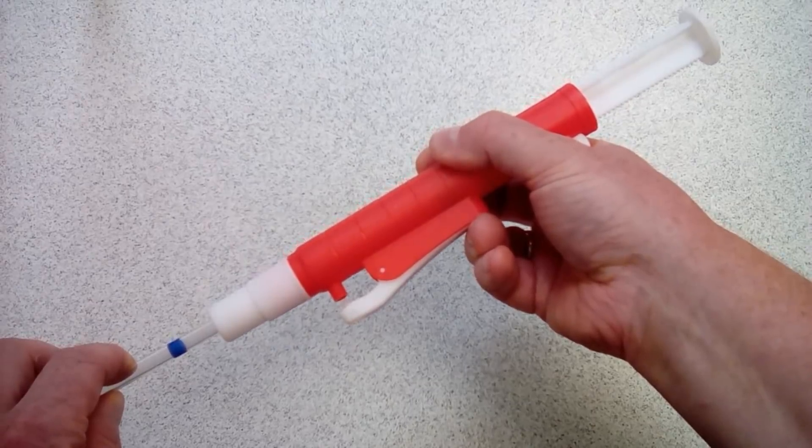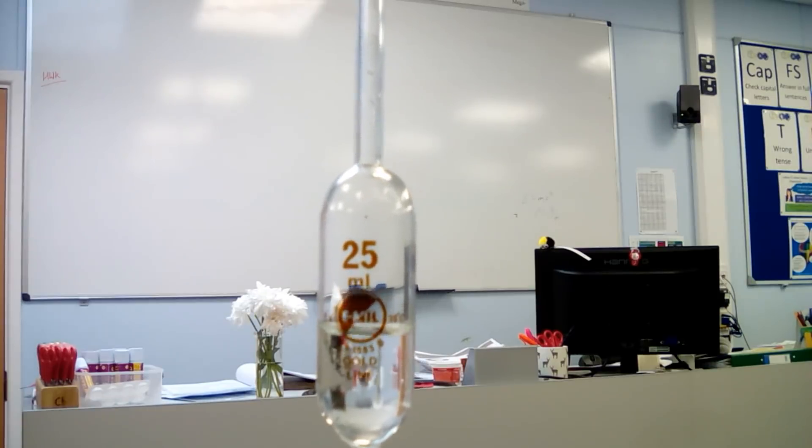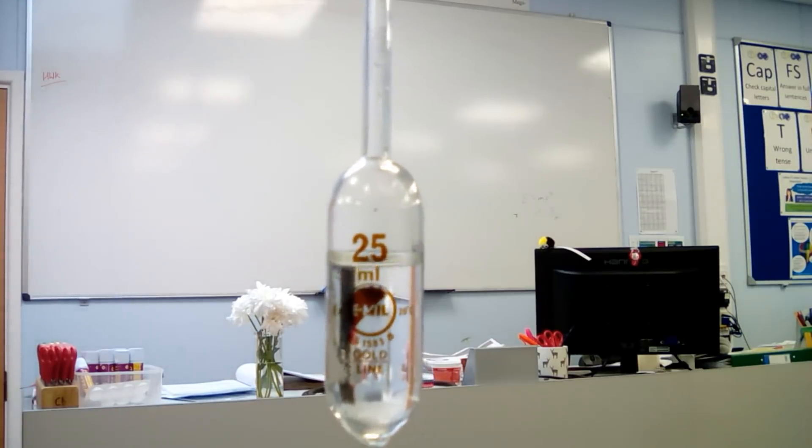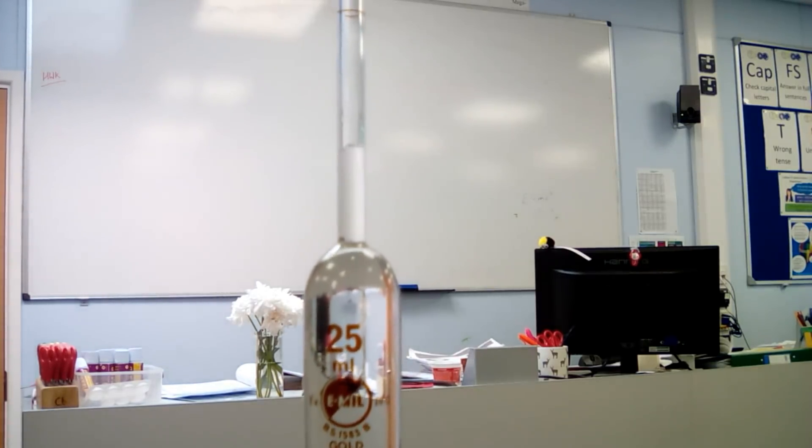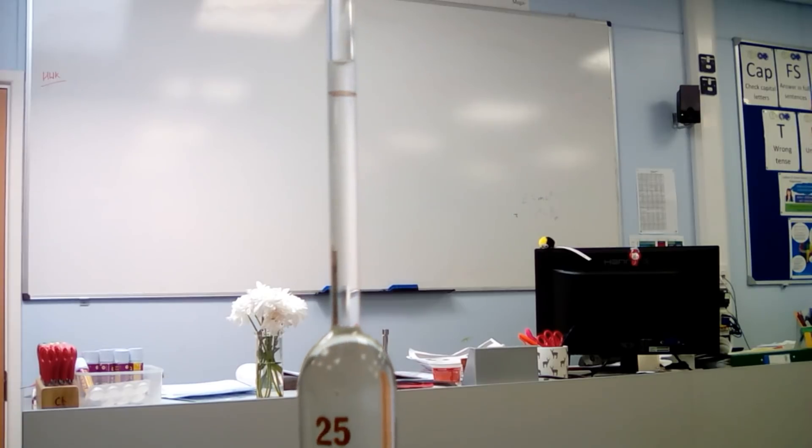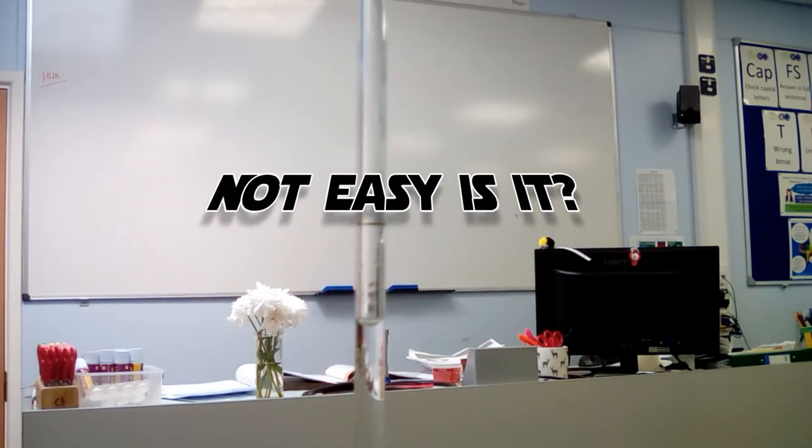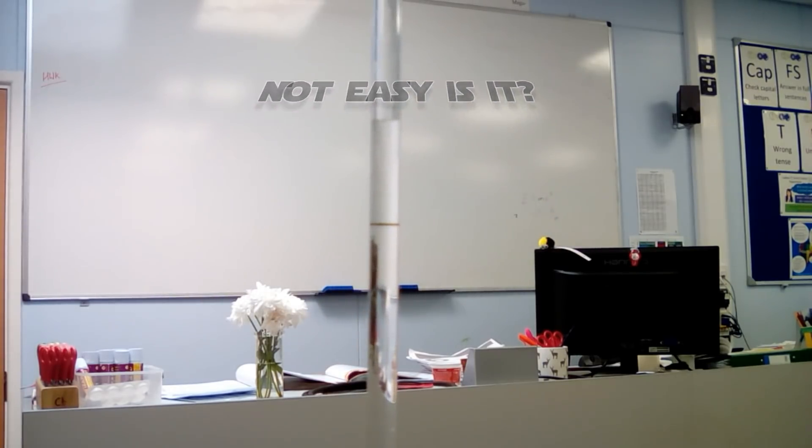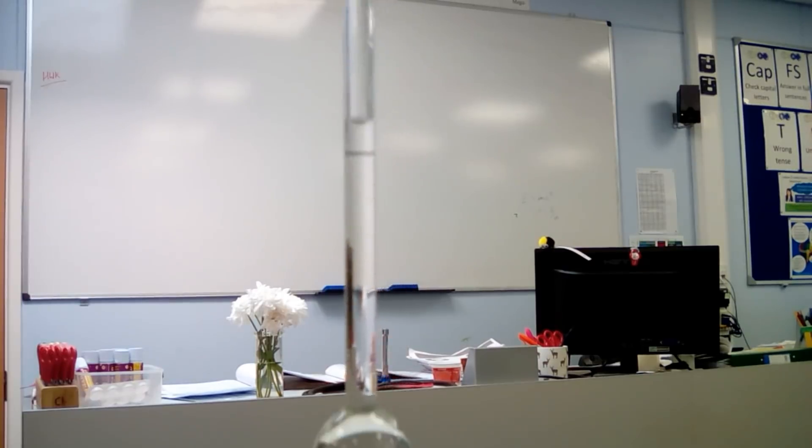With the pipette in the sodium hydroxide, we start to suck up the sodium hydroxide into the bulb. We want to get the level just right. You can see we've gone over there, so we release a little bit of air out and we want the meniscus to be just touching like so.